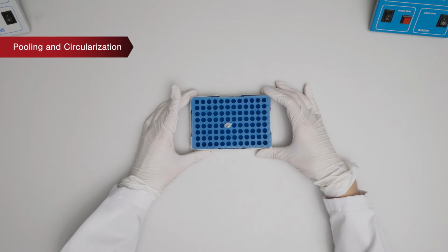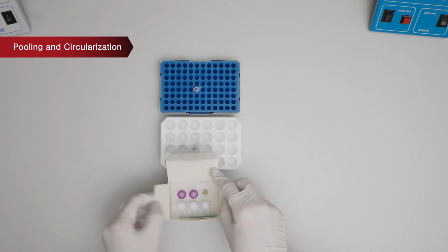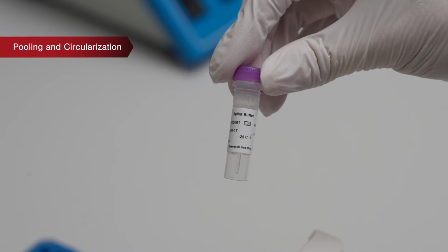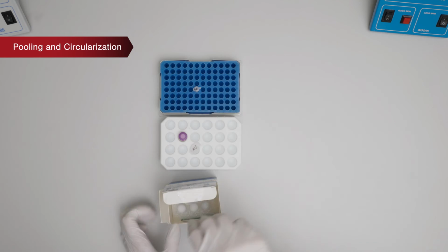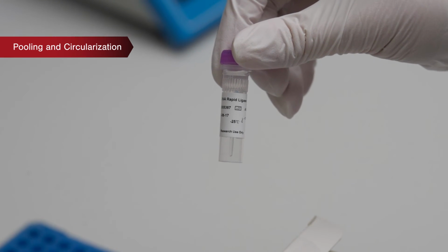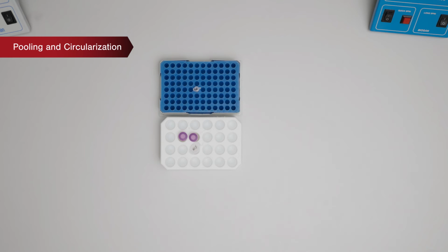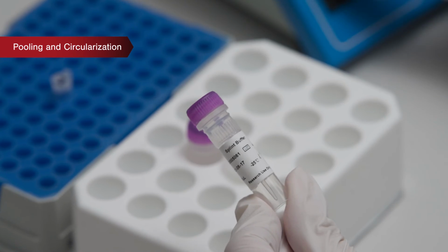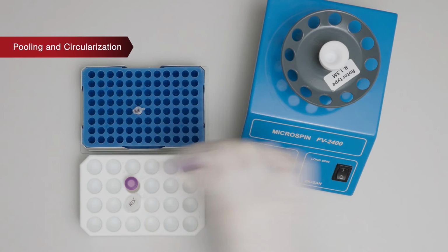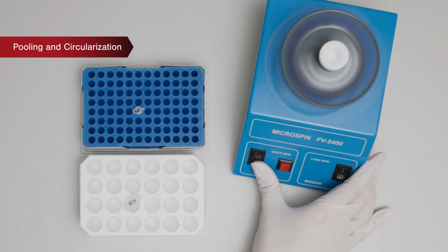It is important to place the samples on ice immediately after the incubation in order not to let the strands bind together again. Prepare the following mix for a circularization reaction by combining 11.6 microliters of splint buffer with 0.5 microliters of DNA rapid ligase for each sample. Splint buffer from this step contains oligos, which bind to the sequence adapter and serve also as a starting point for DNA rapid ligase to attach and start copying the fragment.